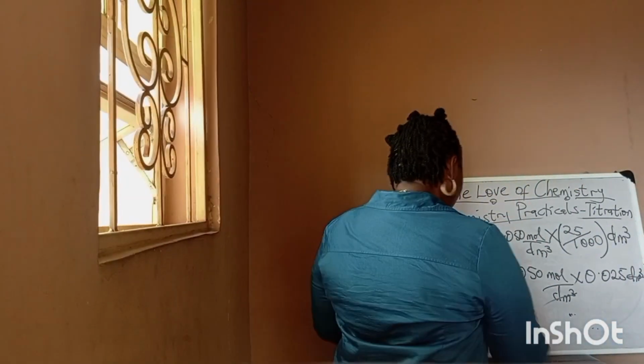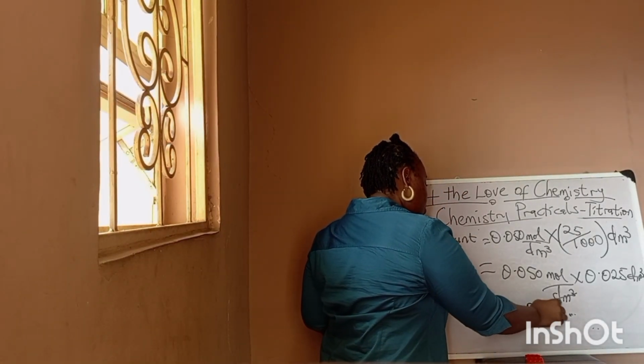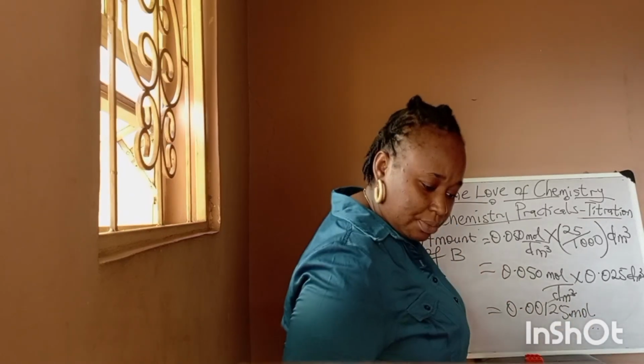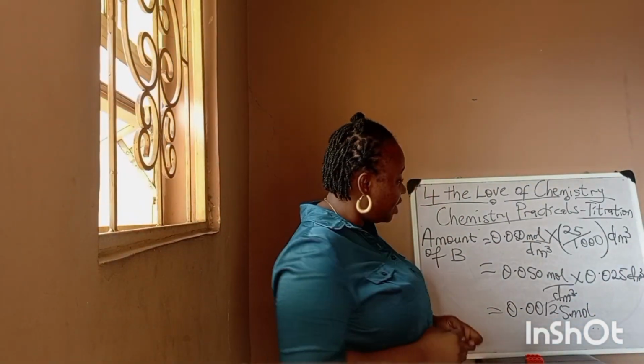So when you multiply the two, you have 0.00125 moles. Yeah, you have 0.00125 moles.